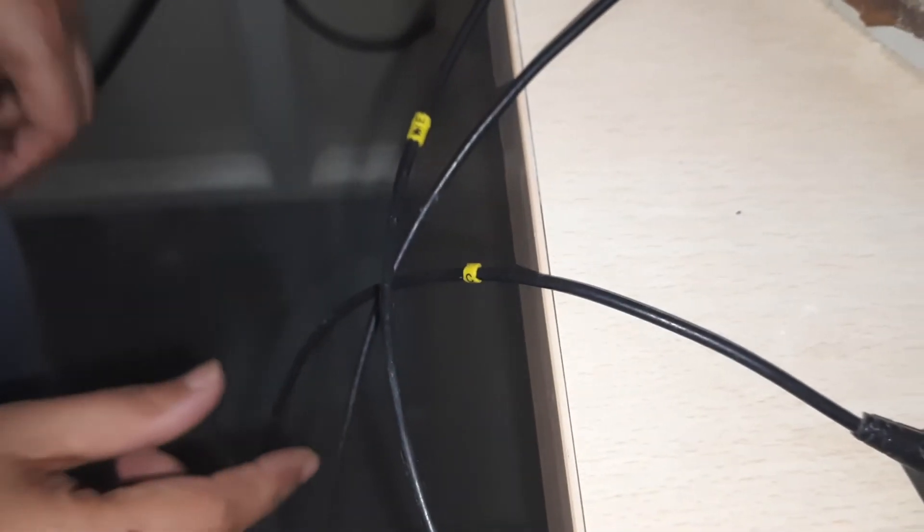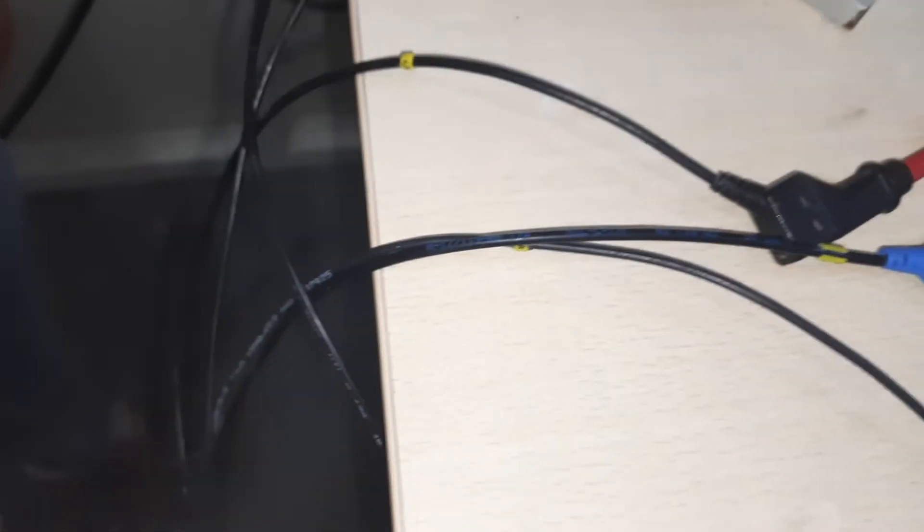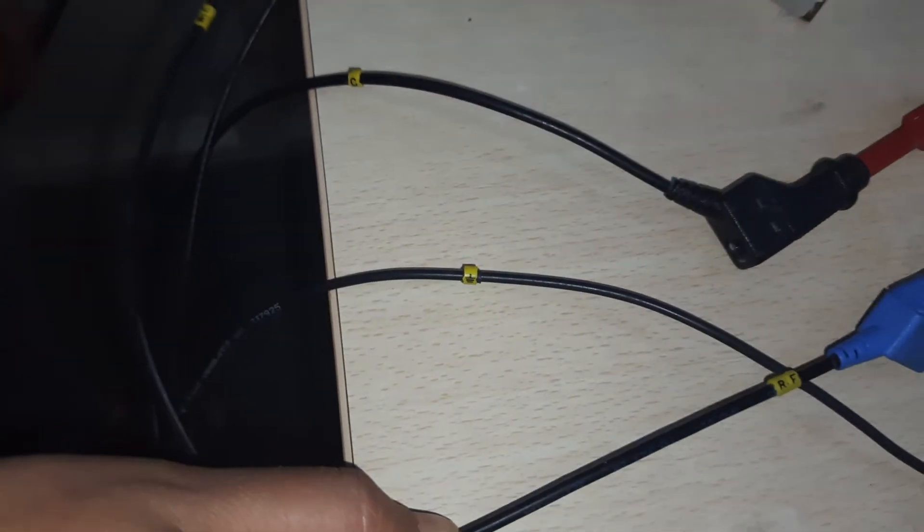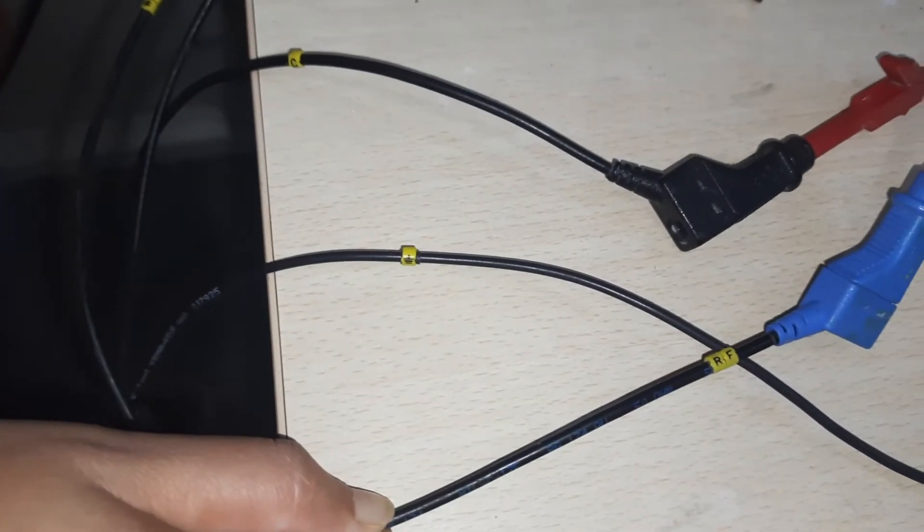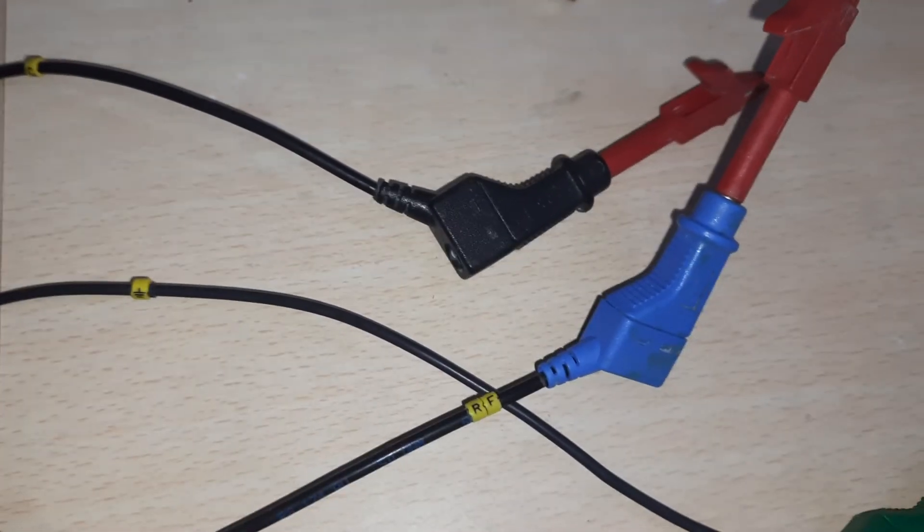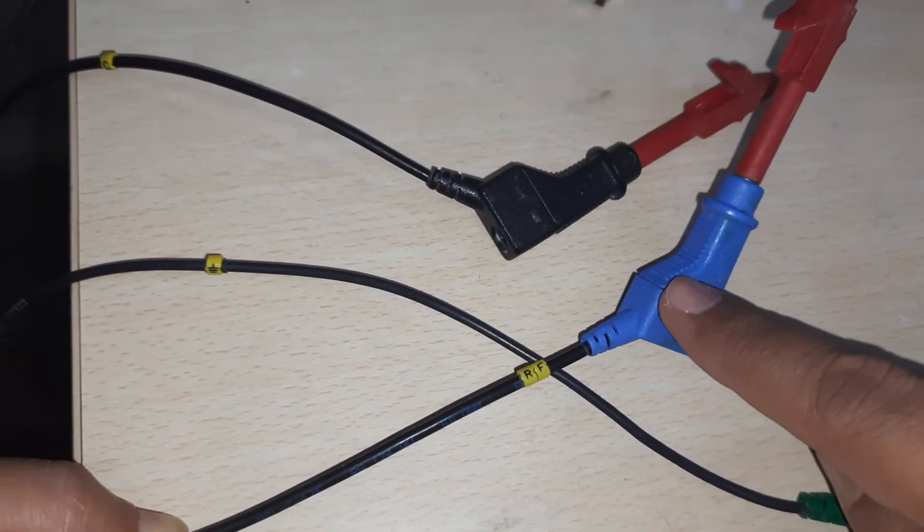This one, you can see, is written C, so it's the counter electrode. And then there is a third one, that is the reference electrode - the blue electrode is the reference electrode.